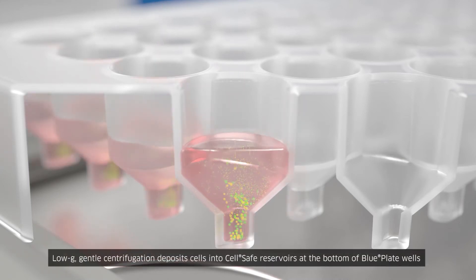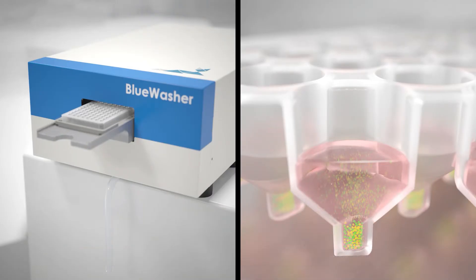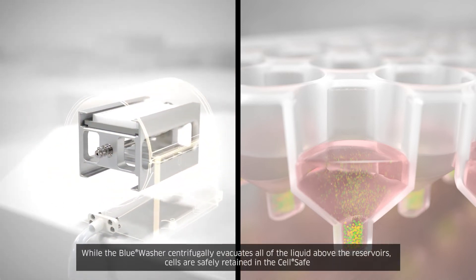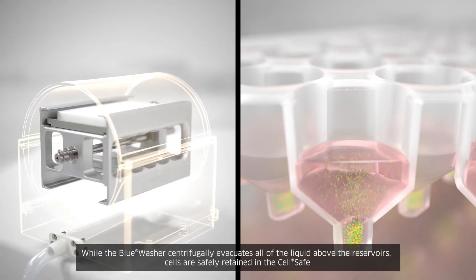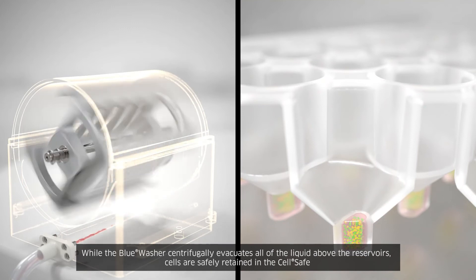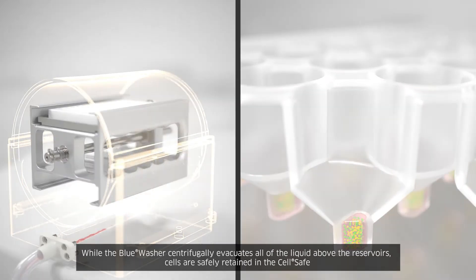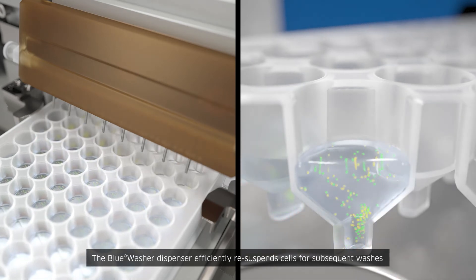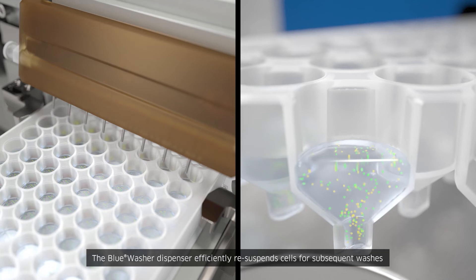Low-G gentle centrifugation deposits cells into cell-safe reservoirs at the bottom of BluePlate wells. The Blue Washer centrifugally evacuates all of the liquid above the reservoirs while cells are safely retained in the cell-safe. The Blue Washer dispenser then efficiently re-suspends cells for subsequent washes.